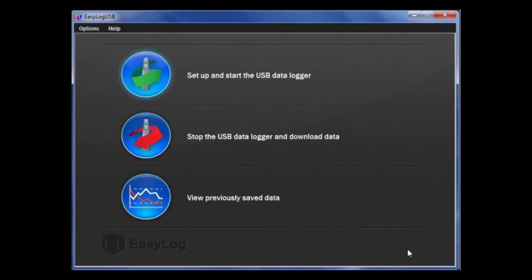Now, you can take the data logger out of the USB port and place it in the desired location as it is ready to start taking data.